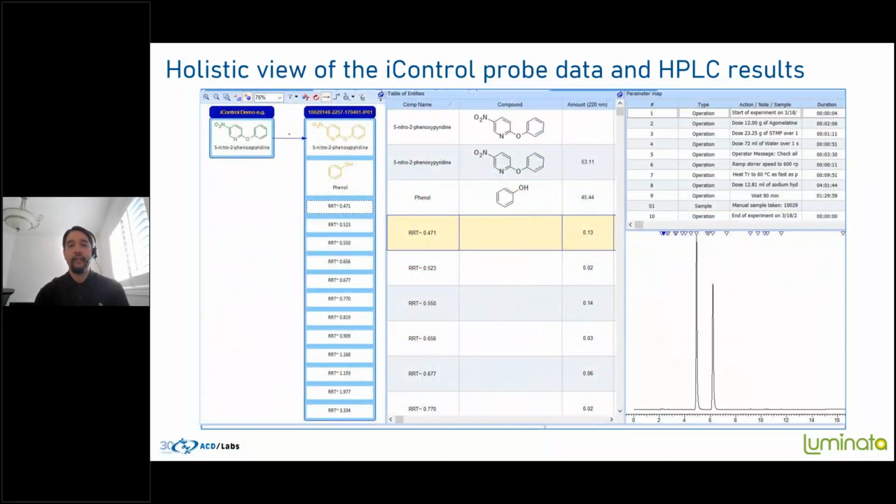On top of just looking at the in-process map, the software allows you to do endpoint maps as well when you're looking at these types of studies for process development. So it creates this endpoint map from your chromatogram. In this case, again, if you have any compounds associated here, you'll see the compounds, but everything else from the peak table will be viewed within this logical map. And that's a crucial thing, contextualizing data.